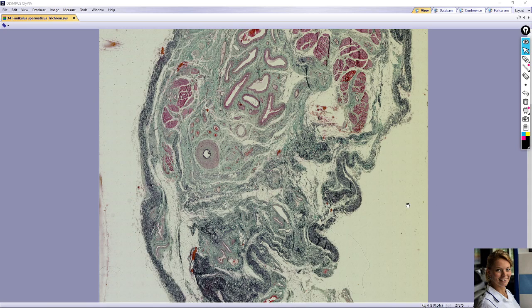In this video we will take a look at the slide of spermatic cord. The slide is stained with the modifying green trichrome, that means collagen fibers are green, elastic fibers are black and muscle tissue is red.